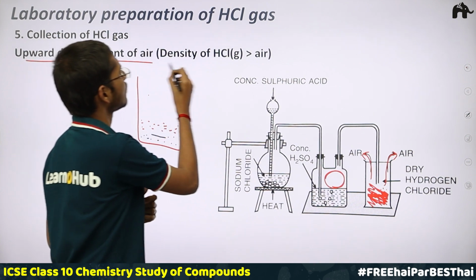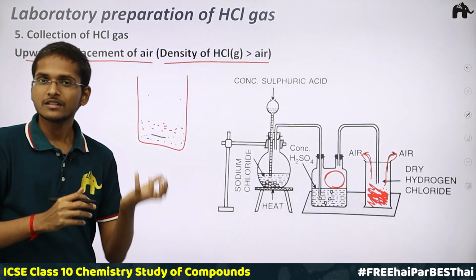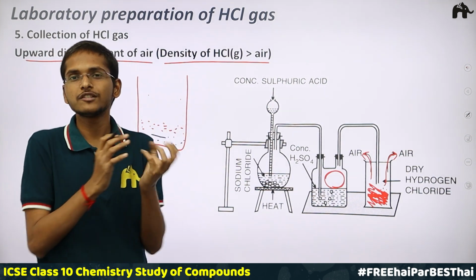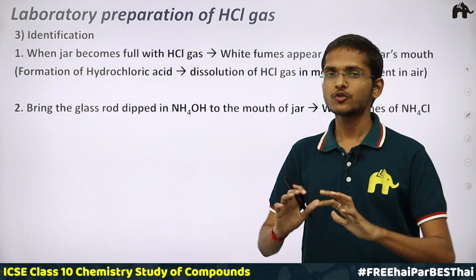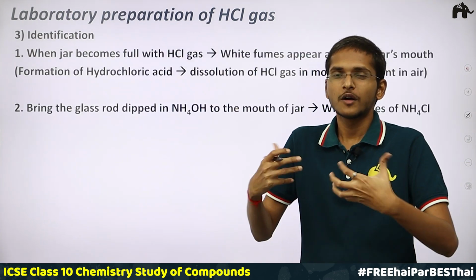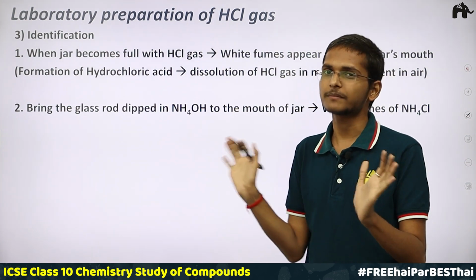This is the reason, and we can also say this in scientific terms: HCl gas density is more than the air. It is more dense than the air, that's why it is settling down. Simple, okay? So yes, we have just prepared our HCl gas, we have purified it, and we are now done with the preparation of HCl gas.